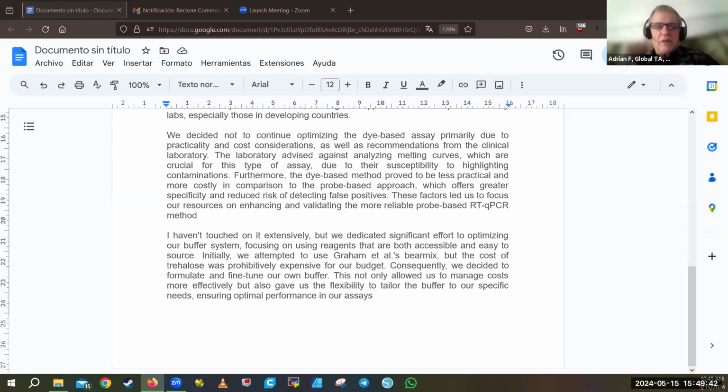Yeah, so I was working on some hardware based on Sebastian Kochaba's work. It's a transilluminator. I'm not sure if you guys are interested in that kind of stuff, but it's homemade, and it's working. Just give me a second.